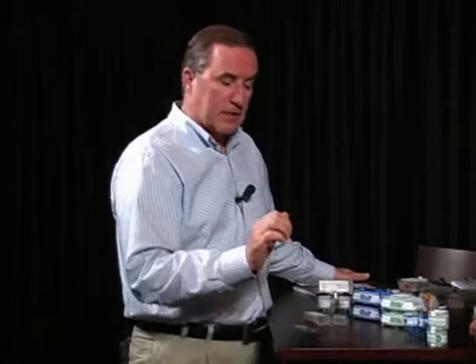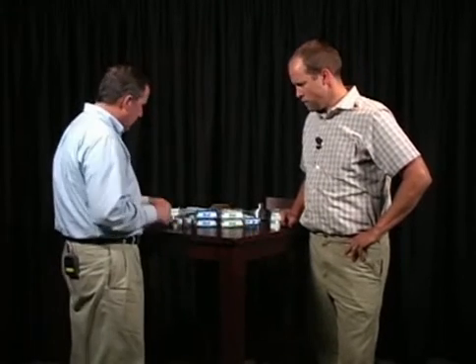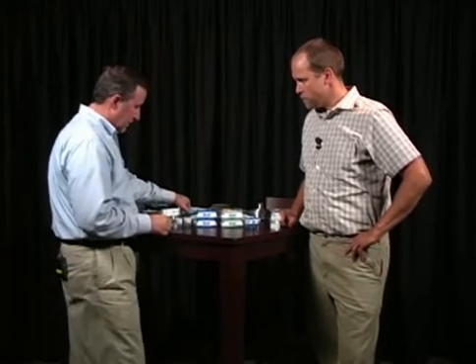And then, of course, you'll want to put your slide in this mailer, close it, label it appropriately, and send it off. It's an easy way to take a sample. I know that I'm a big fan of that sampling technique, and others are too. If we look at another kind of sampler that uses a glass slide, it's the Cyclex.